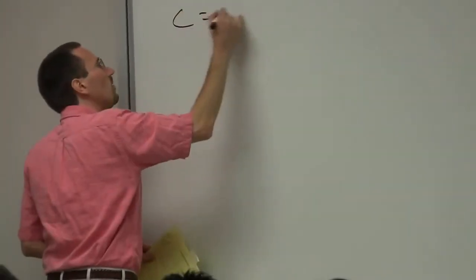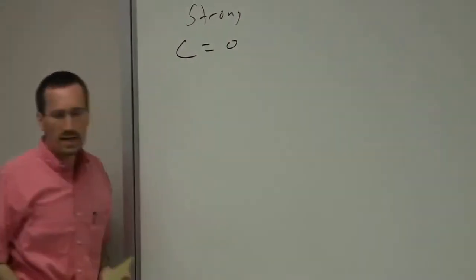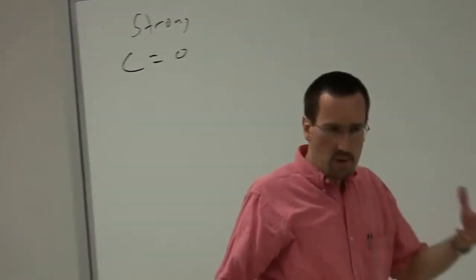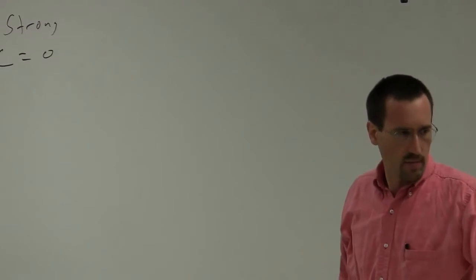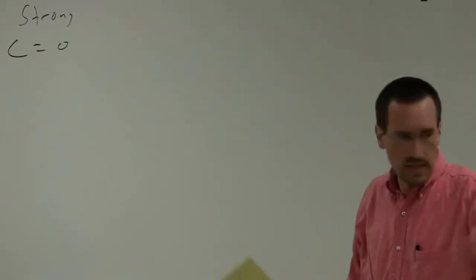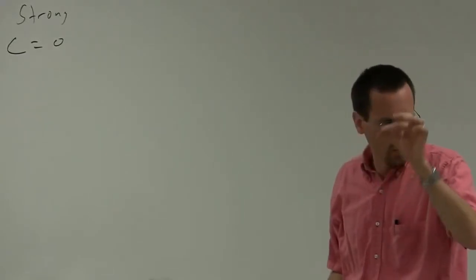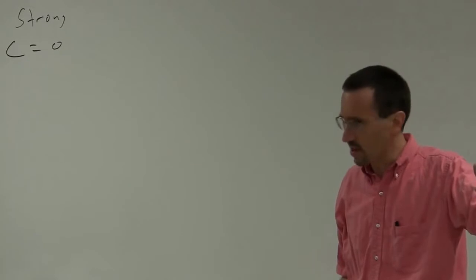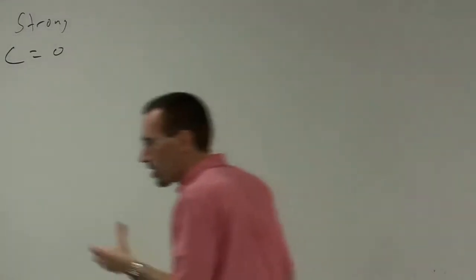So for example, a carbonyl C=O is generally strong, usually strong relative to other peaks. But again, part of that is what fraction of the molecule the carbonyl is occupying. If you have a ketone with 6 carbons in it, you've got a lot more carbonyl groups in that path length than if you have a ketone with 60 carbons. So your carbonyl peak is going to be stronger in smaller molecules than in bigger molecules.